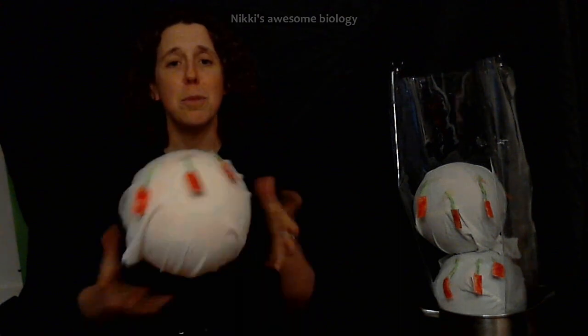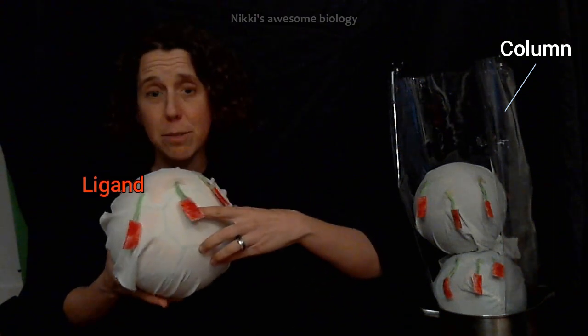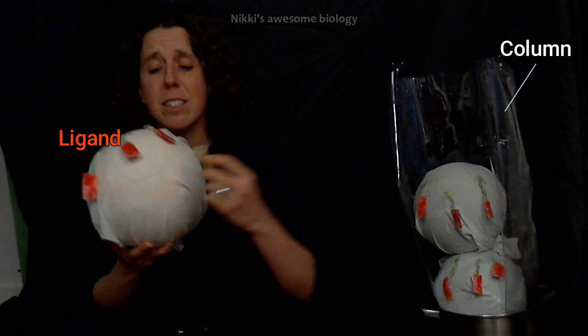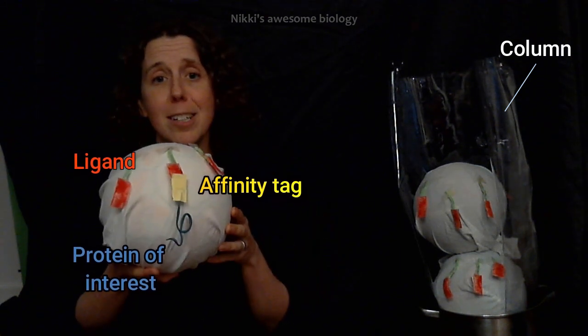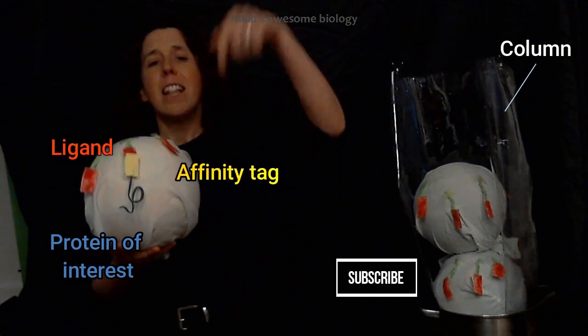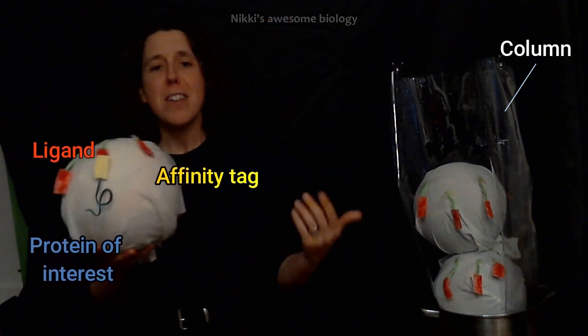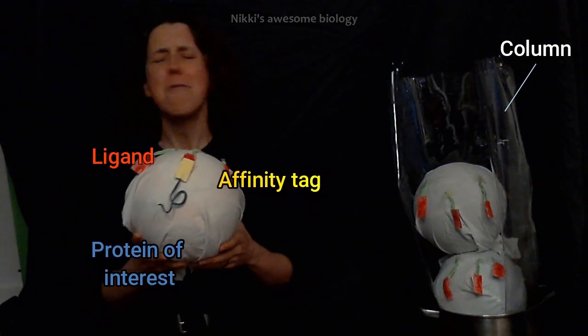Hello everyone and thank you so much for joining me again on another Nikki's Awesome Biology, where today I'm going to be talking about a kind of protein purification called affinity chromatography or affinity purification, where we can take beads inside a column and using this really cool kind of molecular velcro, we can pull out proteins that we're interested in out of a protein mixture and end up with a pure protein sample. Hold on to your ligands and your tags as we explore affinity purification.